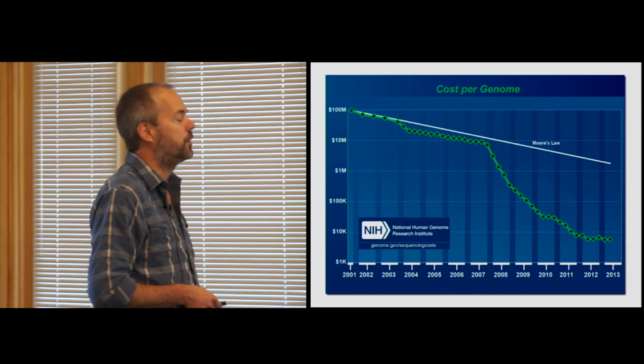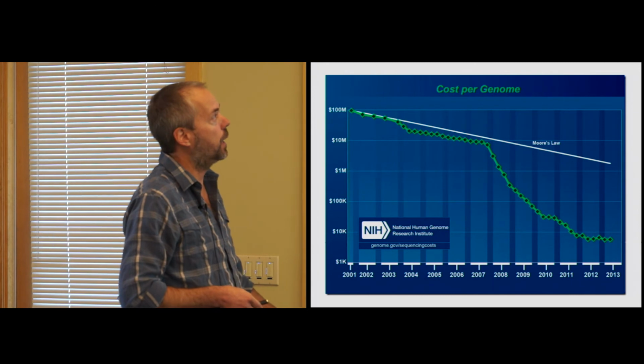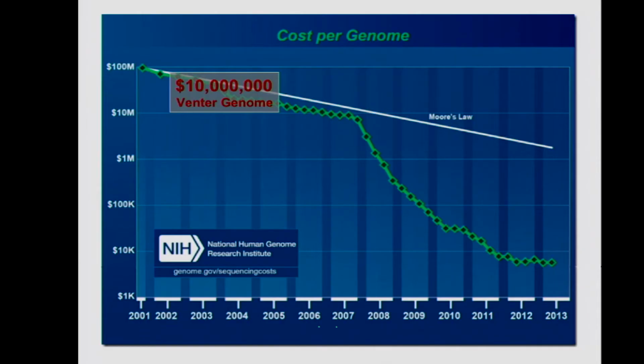It's well circulated in talks and lectures, but I'm going to recycle it one more time. On the x-axis here, the time, and I'm a couple years behind. On the y-axis, a log-scale cost to sequence an entire genome.